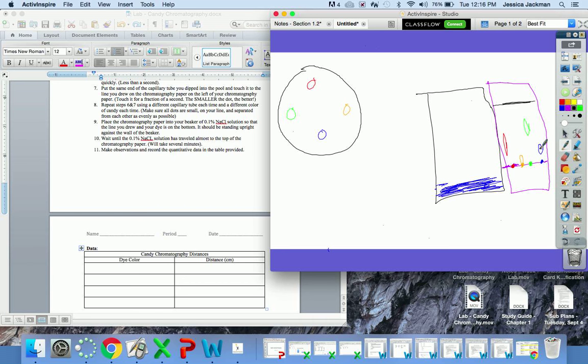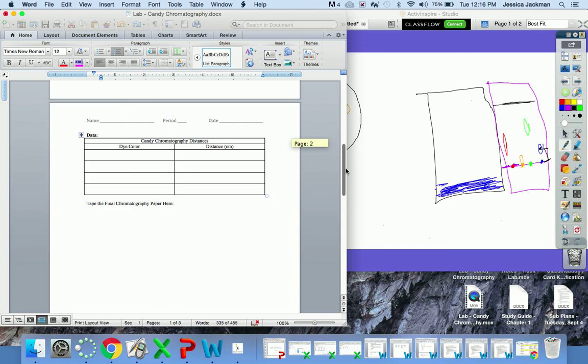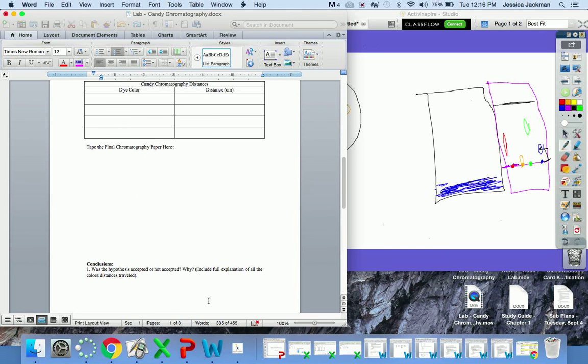You're going to take that center and measure from there to the line. This is called an Rf factor, but we're just going to call it the distance traveled. You're going to measure that in centimeters and write it down. So the dye color, I'd say blue, and maybe this distance is like half a centimeter. You'd put 0.5 centimeters down for that. You do that for each color. Then you're going to use that data later to help answer your questions.